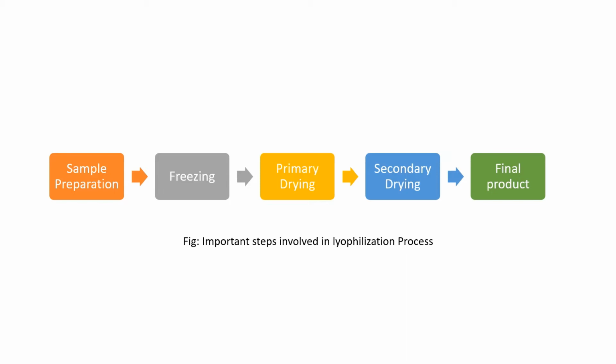The first step is sample preparation or pre-treatment. Pre-treatment or formulation is the key method or process of treating the product prior to freezing, and the processing and formulation development are important steps often taken to make a product ready for freeze drying and usable for its specific application.